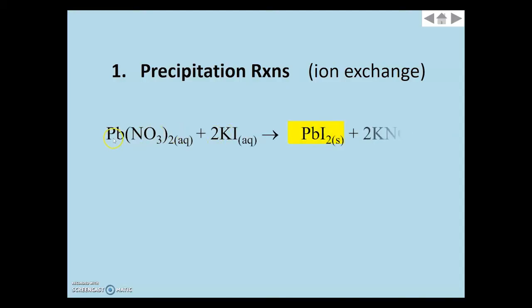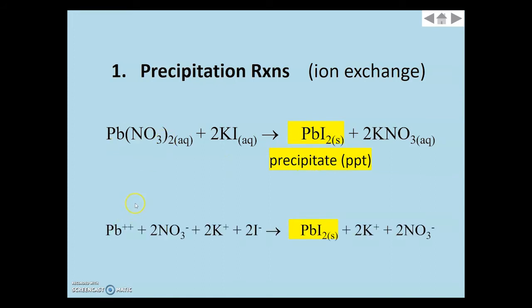We have just seen that lead nitrate, a clear solution, plus potassium iodide, also a clear solution, makes instantly this bright yellow lead iodide precipitate. Don't forget that these AQ symbols mean that the ions are all separated. They are all dissolved. Lead iodide is insoluble. Meaning when these are put in together, they automatically stick together, forming the precipitate.